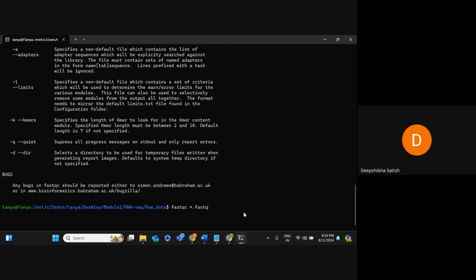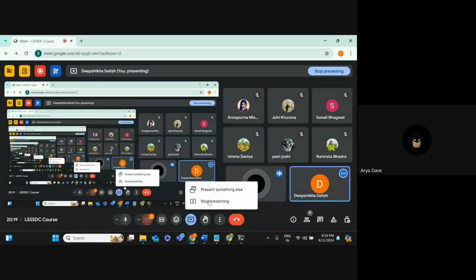Can you? One of you guys can share your screen so that I will be sure you are able to do that. You all have to run this FastQC in your system. Okay, it will take some time. Just share your screen, one of you. I'll do it, ma'am. Yeah, sure.